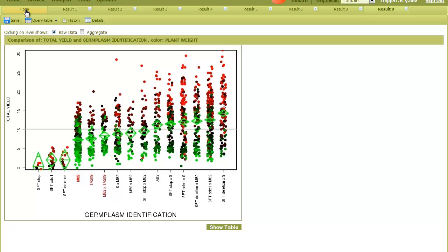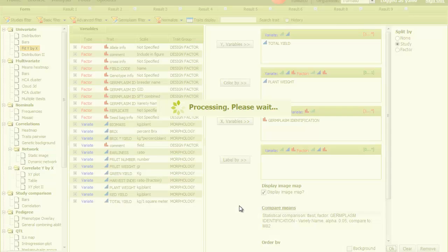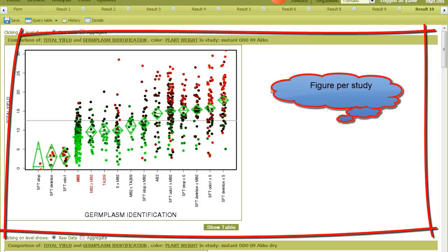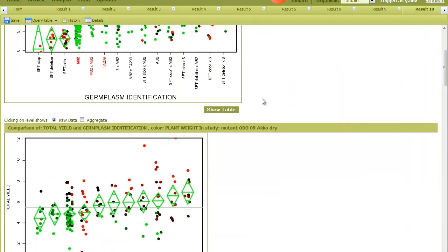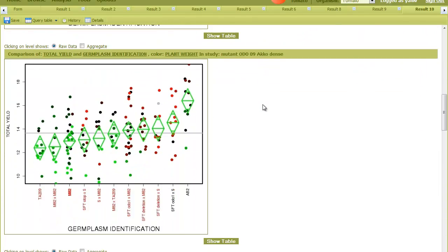Alternatively, I can go back and perform the analysis per study by selecting this check box. Now we can see a figure and the statistical comparison for each study separately.